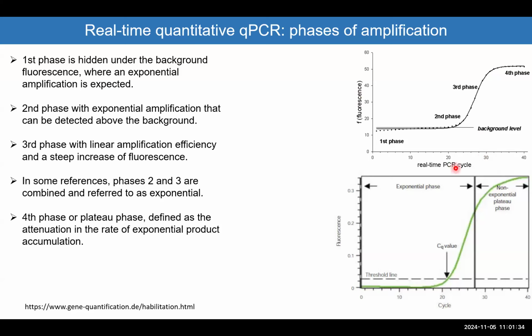And this is a typical qPCR curve, where there is no PCR product detected, and as you add more and more cycles, you start to have amplification. The more and more cycles, this means you are adding more and more fluorescence to the double-stranded DNA, or in condition of the TaqMan, the reporter has been released and you get more fluorescence there.